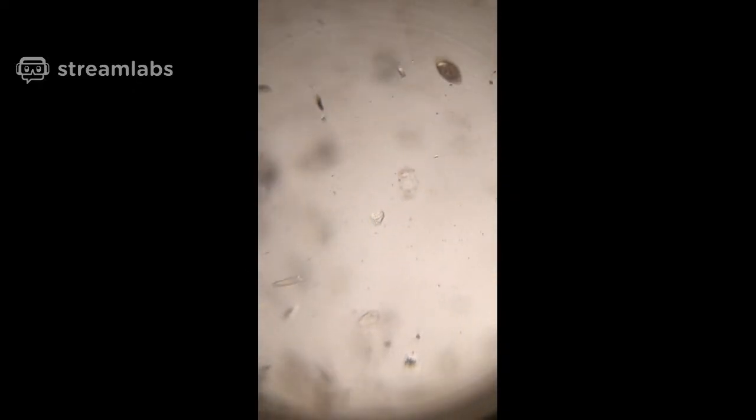Now, this is a remarkable ciliate. I cannot tell you how happy I am to see that. I actually saw them after 6 months and they're still doing reasonably well in my hands. I may have to passage them in the next couple of days. Notice the thing about the ciliate is that it comes in many different shapes. Now, I do not know if the many different shapes are seen here. You definitely see this shape, right?